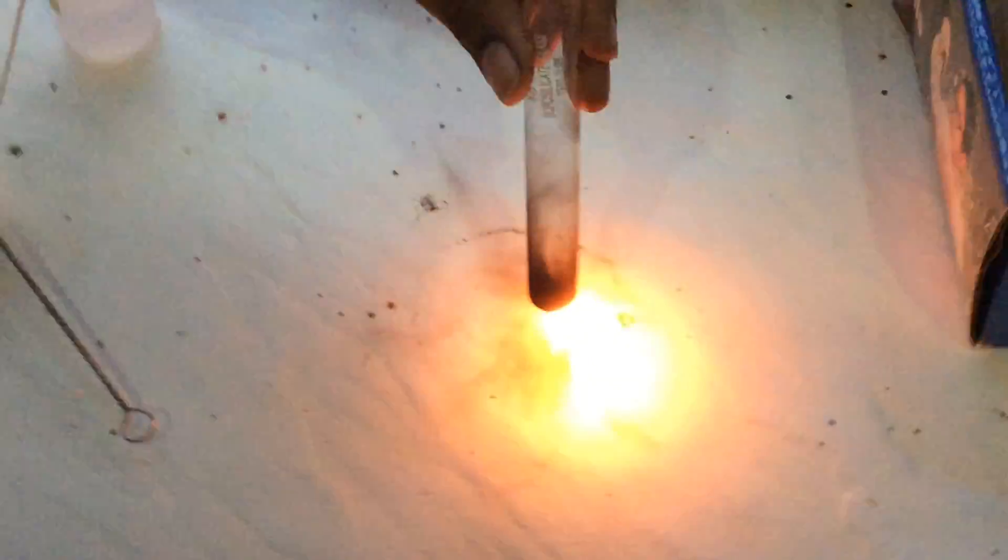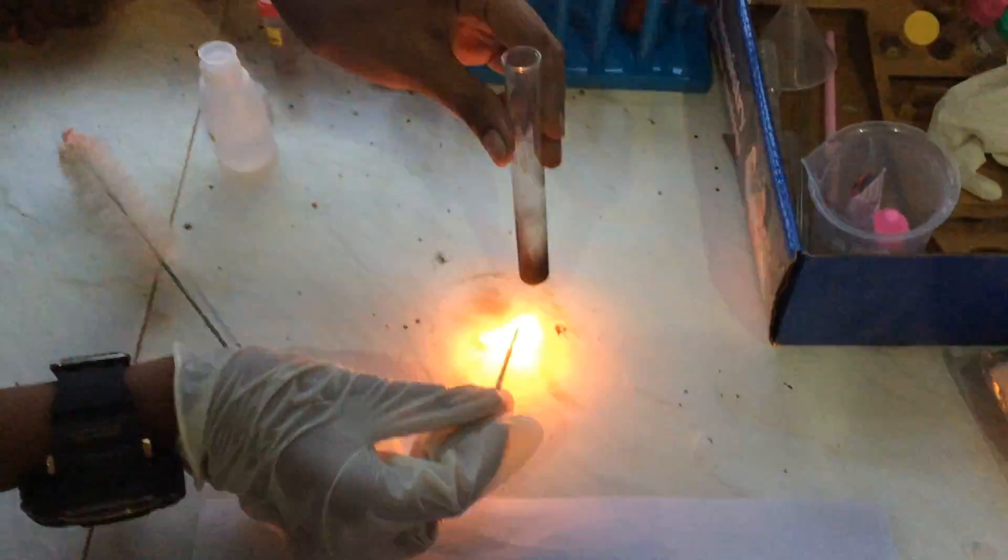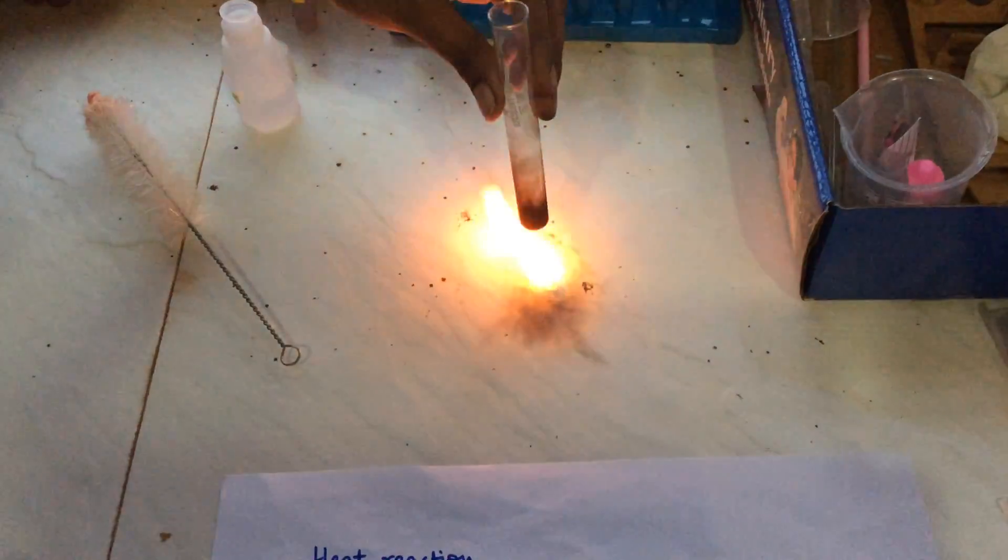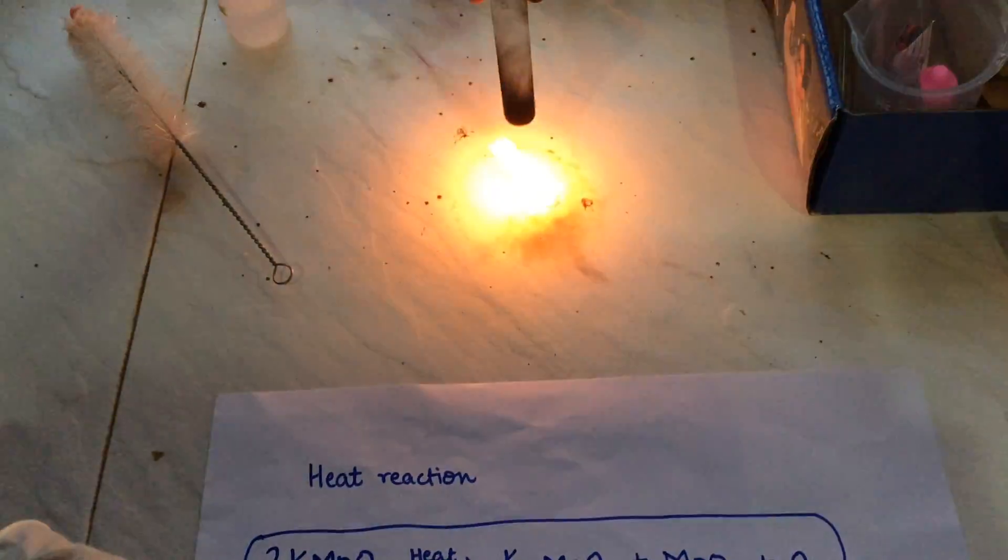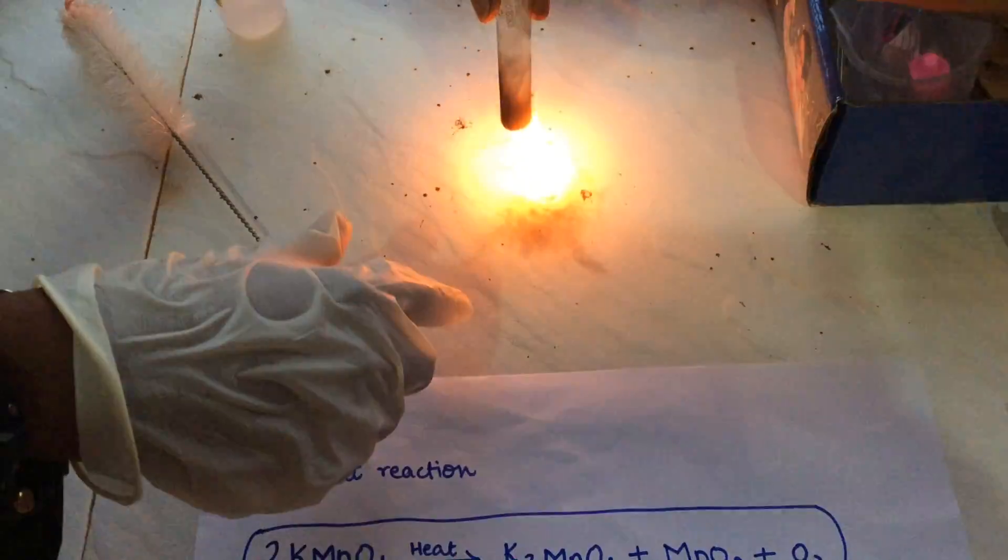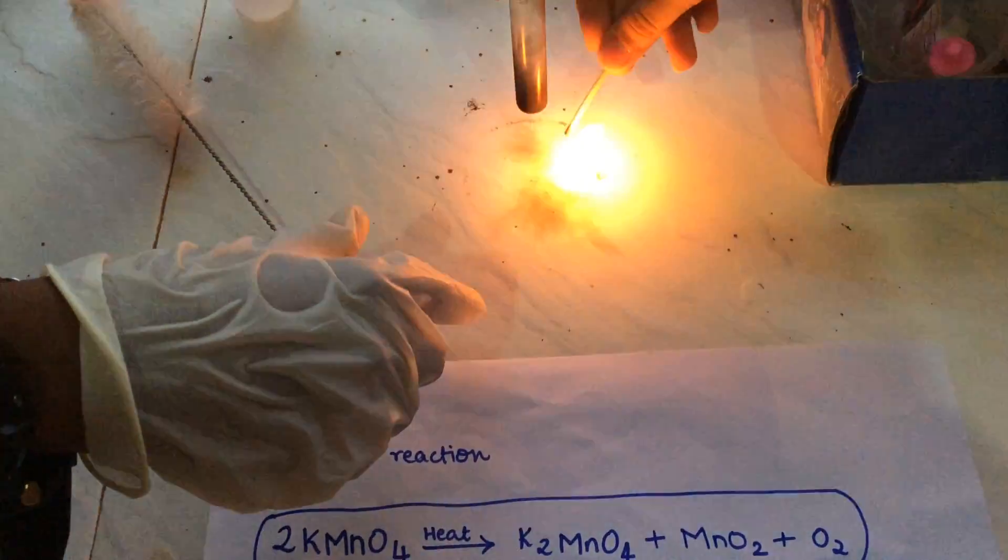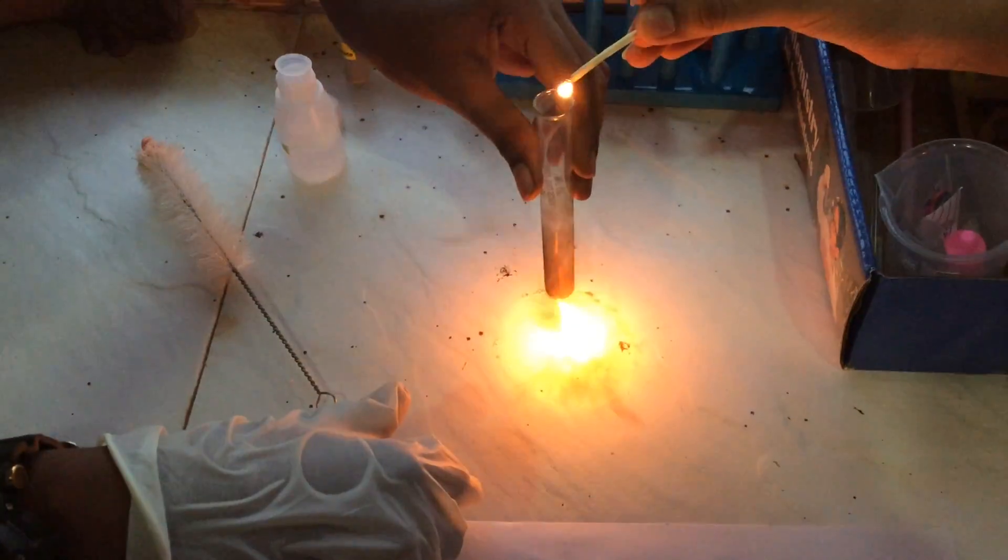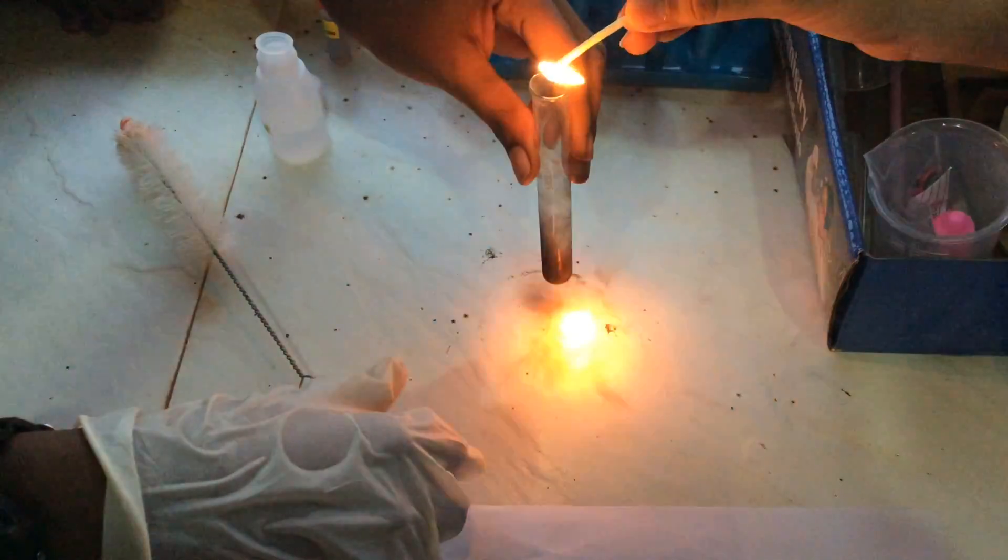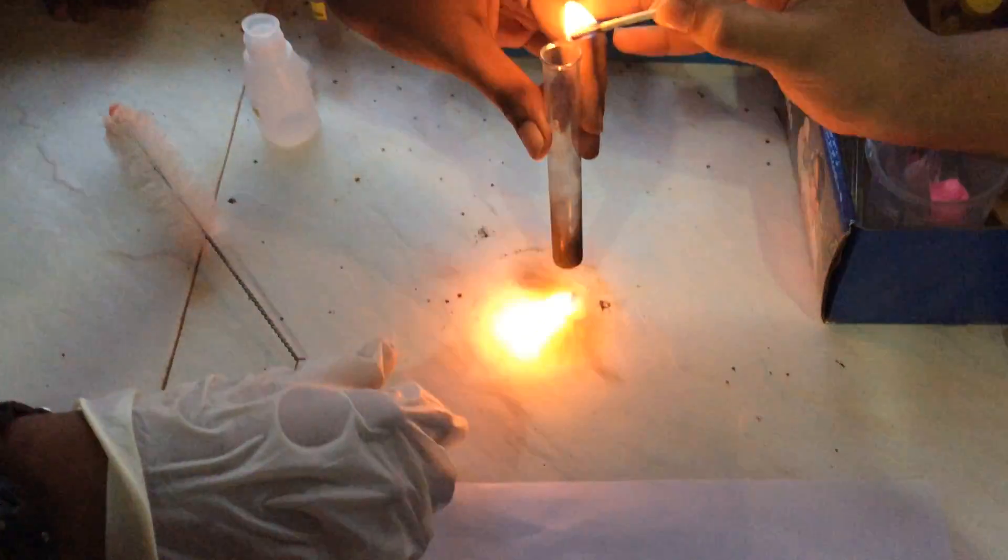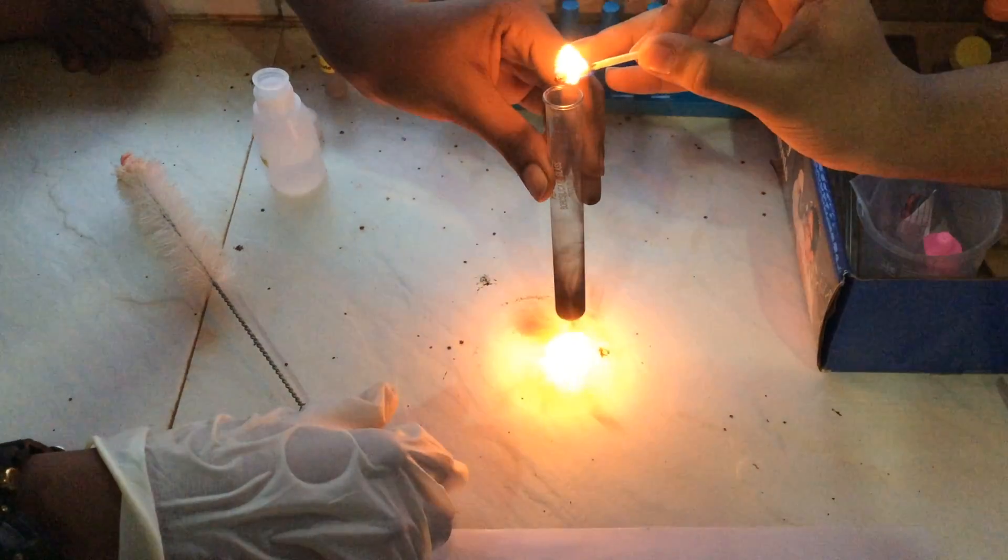Keep on observe the glow. The tip of the glowing stick is re-kindled, re-lighted and our flame becomes bigger and brighter, where it is exposed to the gaseous product, i.e. oxygen. See, the flame is increasing because the test tube is releasing oxygen gas and that is supporting the burning over here.